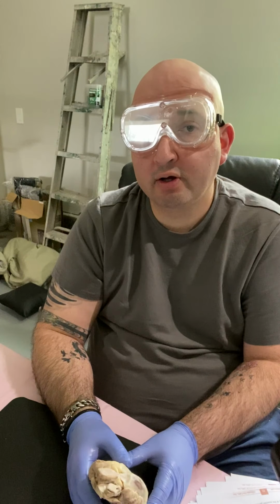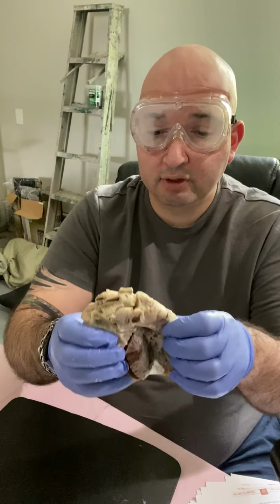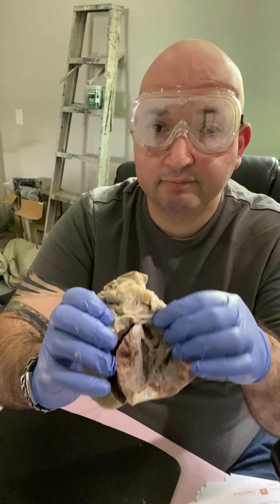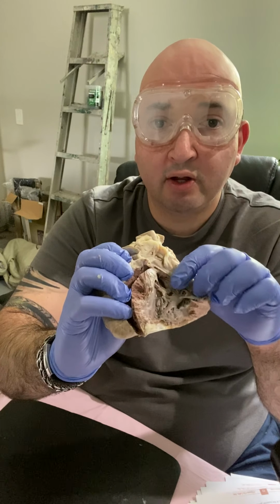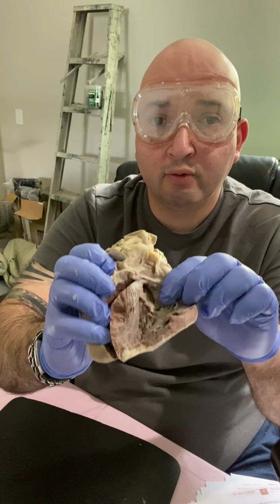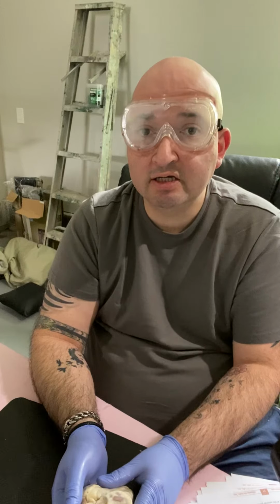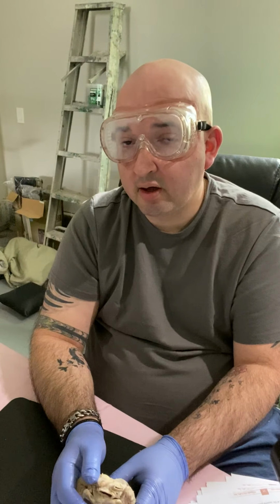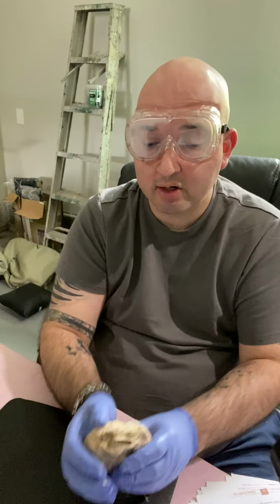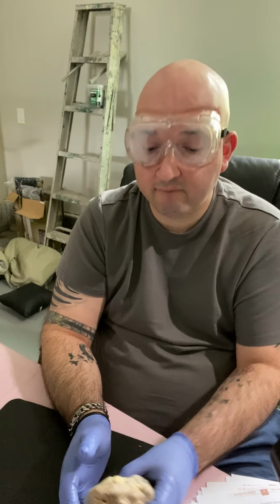So the first part of the sheep heart I'm going to talk about is the right atrium, that I'm going to show you from the posterior aspect of the heart. And my right atrium is right about there. What the right atrium does is it receives deoxygenated blood from the systemic circuit, pretty much the entire body, from the inferior and superior vena cava.